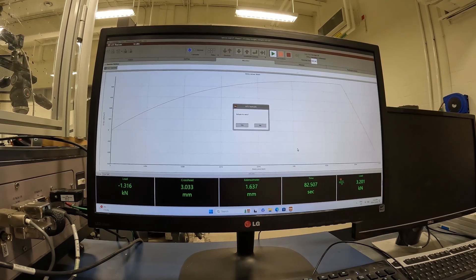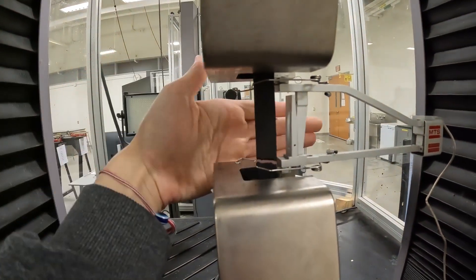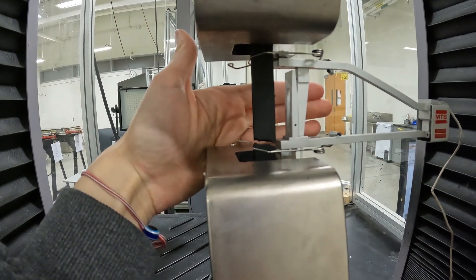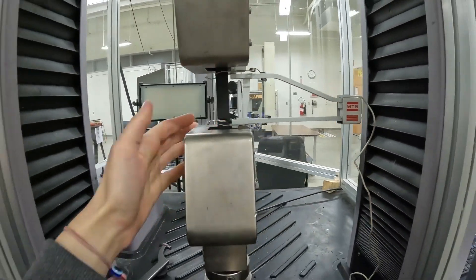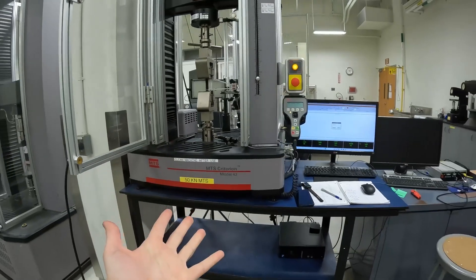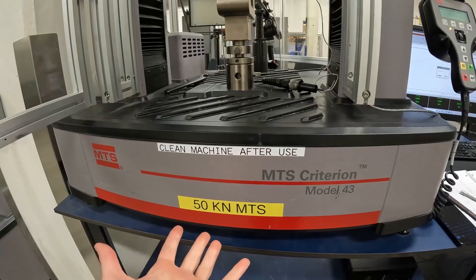Our sample failed — not sure if you heard that. Coming back to our system, you can see the obvious crack in the sample. And that is how you run a tensile test on the MTS Criterion Model 43 testing machine.